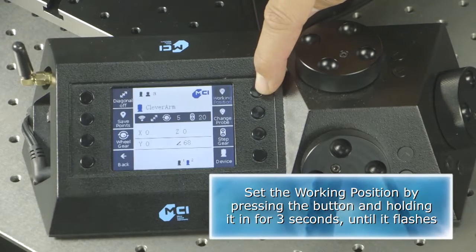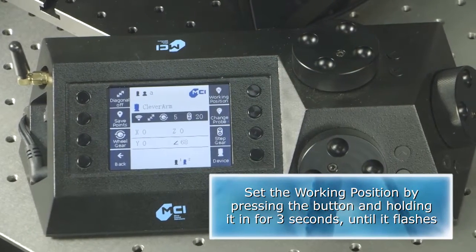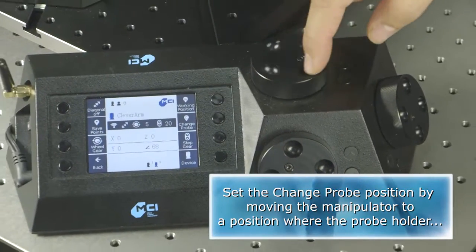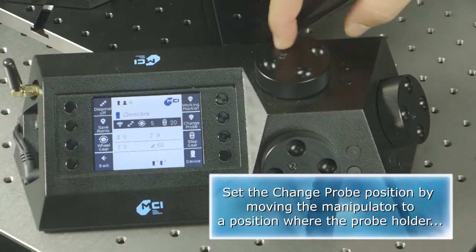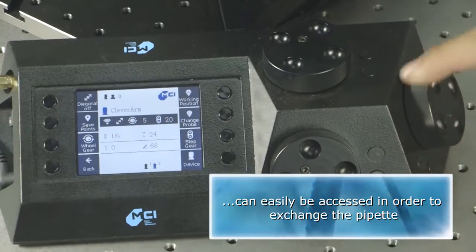Set the working position by pressing the button and holding it in for three seconds until it flashes. Set the change probe position by moving the manipulator to a position where the probe holder can easily be accessed in order to exchange the pipette.